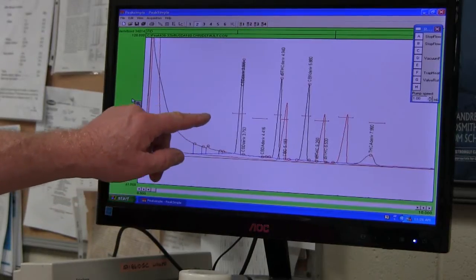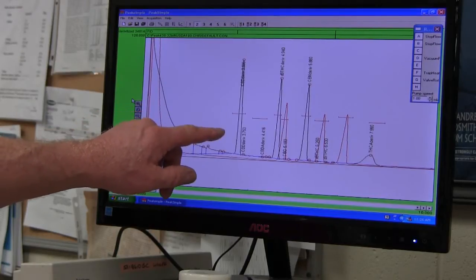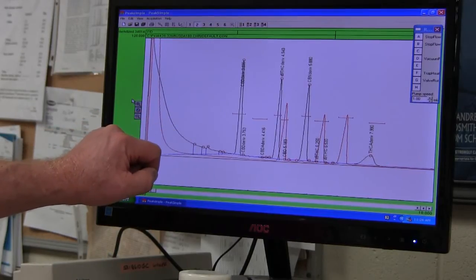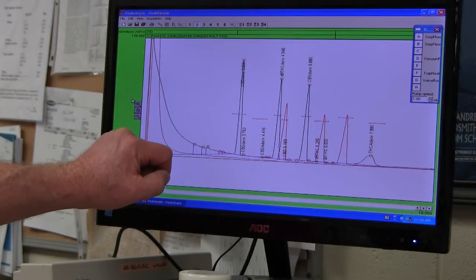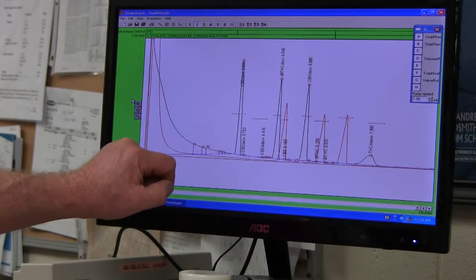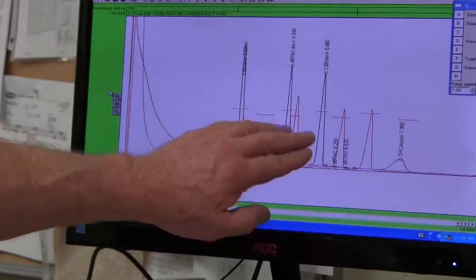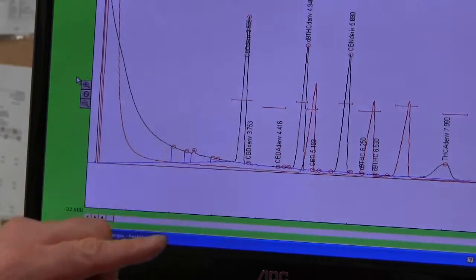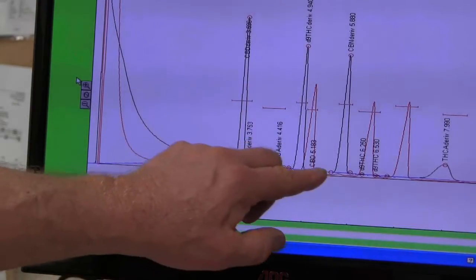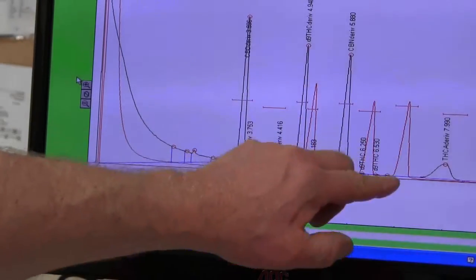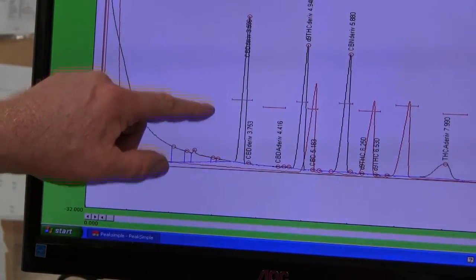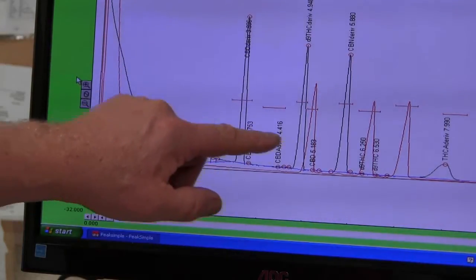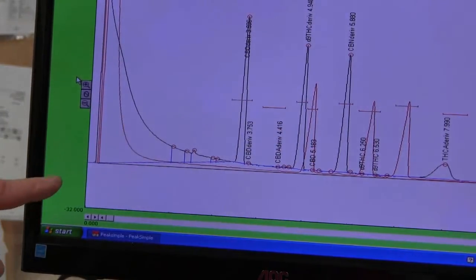So the chromatogram that results when we inject the derivatized cannabinoid standard, which contains CBD, delta-9, and CBN, we get the peaks shifted earlier in time than they were originally when they were underivatized. The red shows the underivatized peaks. The black shows the derivatized peaks. And you can see that they come out at an earlier retention time.